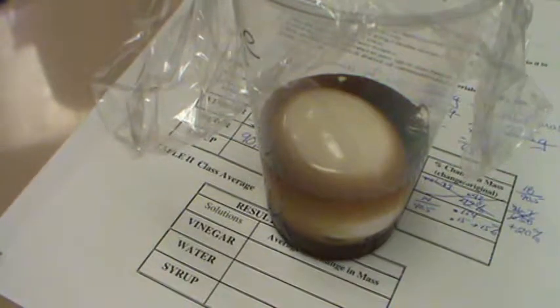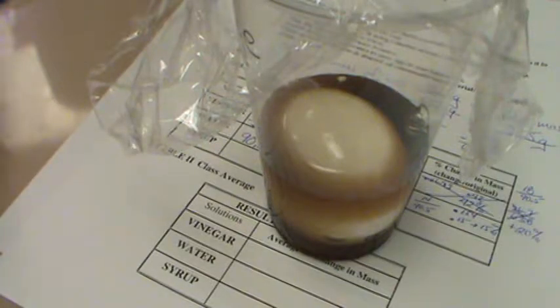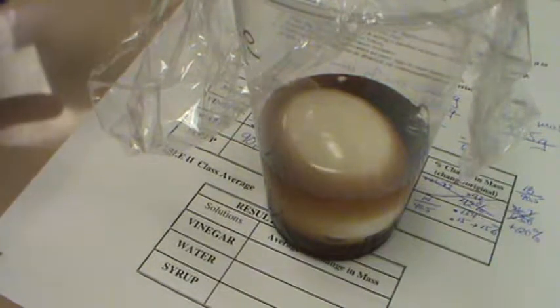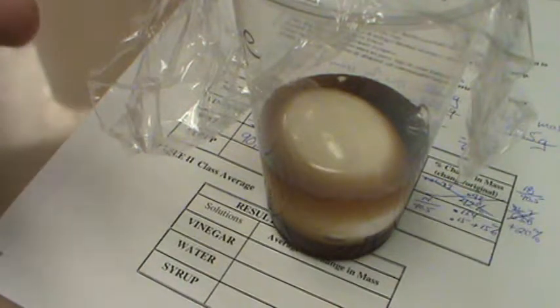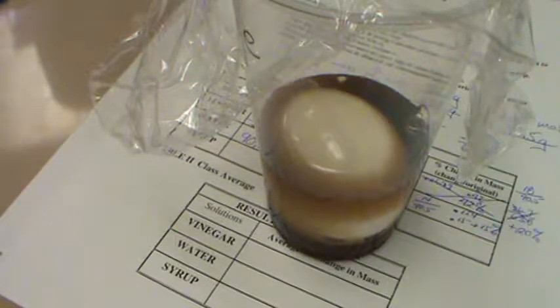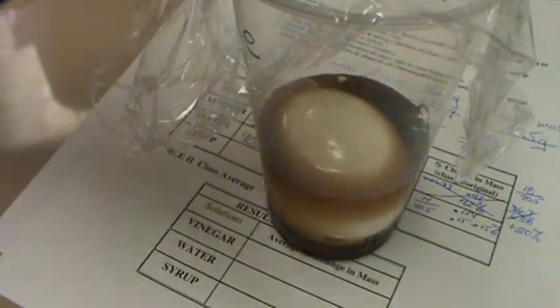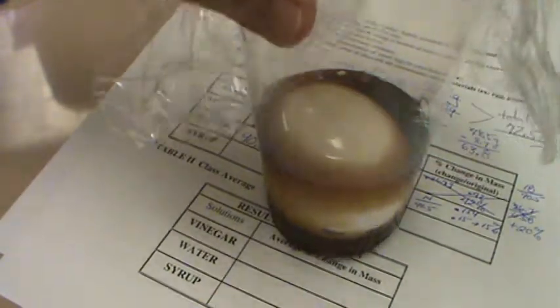Will it go back to the original 63? I don't know. We'll find out. Never done this one before. Can't tell you what's going to happen, but I can tell you that there will be an explanation video with some drawings, and there's going to be an after the lab, because I want to see if there's actually a yolk and an albumin, or the white, still inside that egg. Plus, I know all of you are going to want to know, because it feels like a rubber ball, is it going to bounce? So we'll find out on Monday.